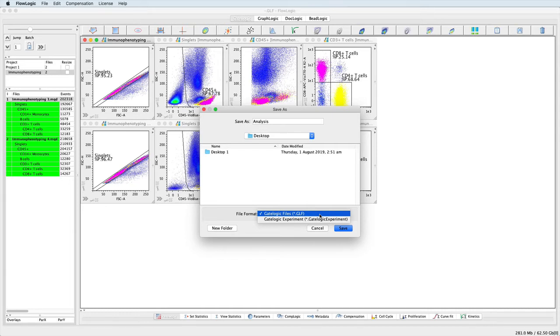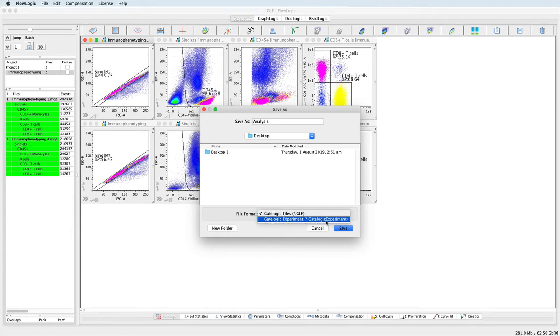On the other hand, saving the analysis as a GateLogicExperiment will compress all of the FCS files and the analysis into a single file.